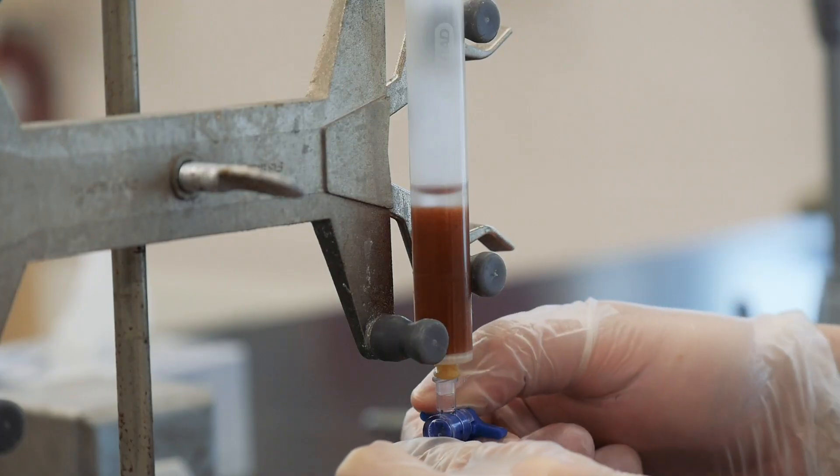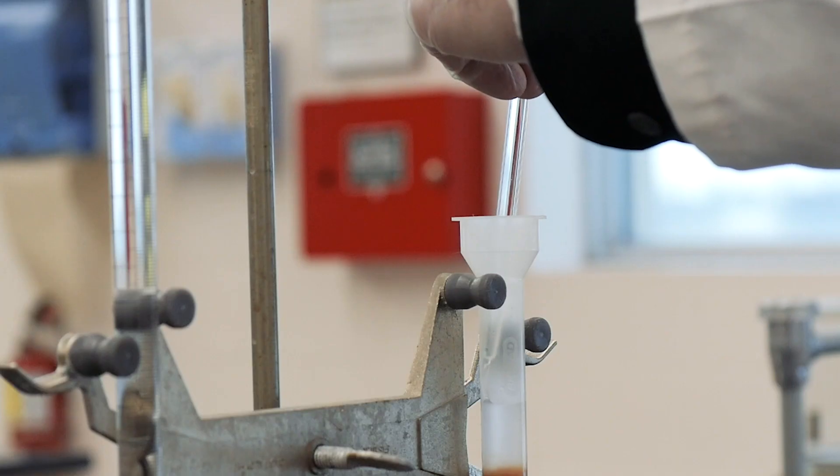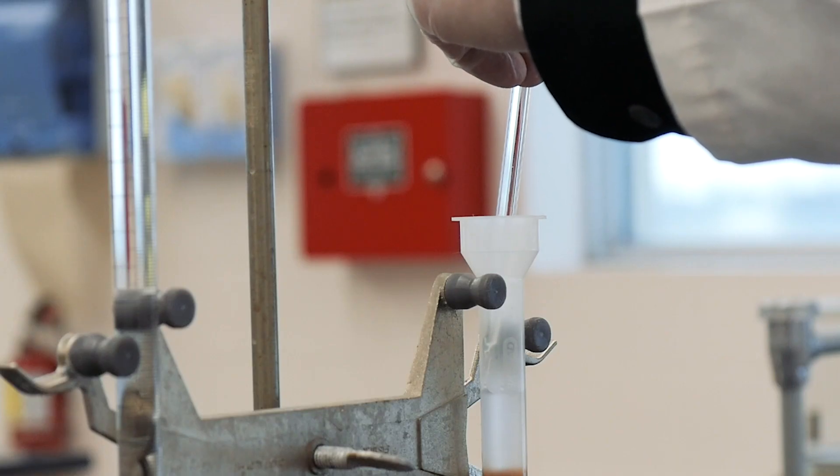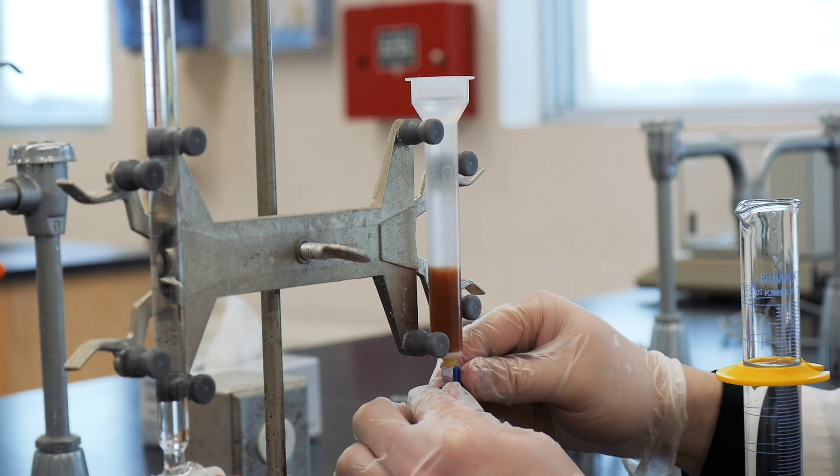When that's done, wash the excess acid off the column with 200 mils of deionized water by adding it slowly to the top of the column and allowing it to drain until just above the level of the resin.